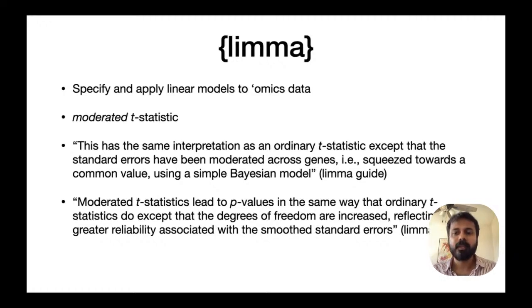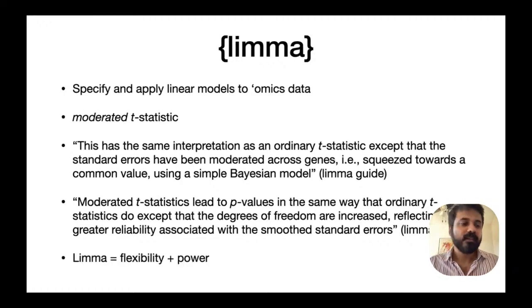And there's another quote from the limma guide that I think is useful. Moderated t-statistics lead to p-values in the same way that ordinary t-statistics do, except that the degrees of freedom are increased. So this is another reason why applying these moderated t-statistics increases the power of your approach. And this reflects the greater reliability associated with the smooth standard errors. So again, take-home message is limma equals flexibility plus power.